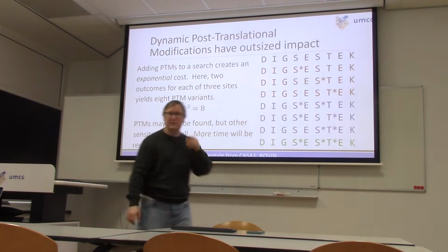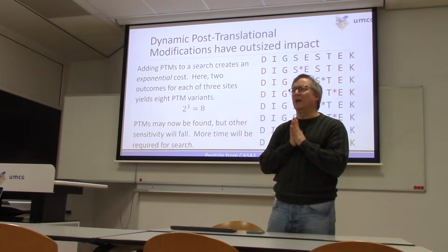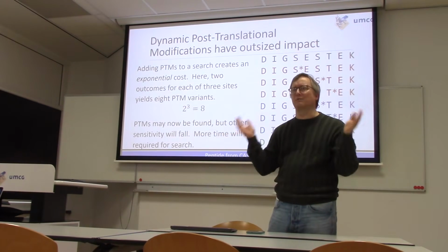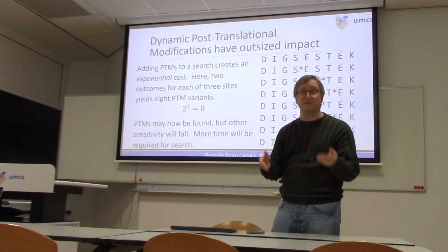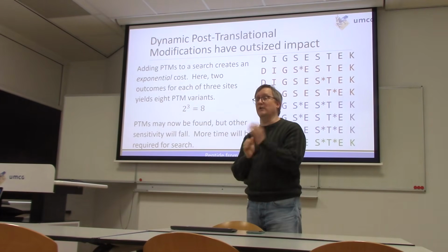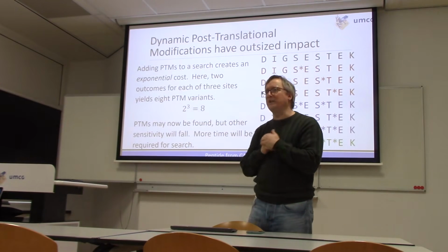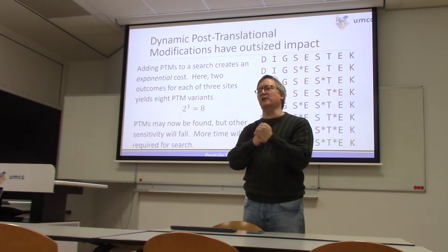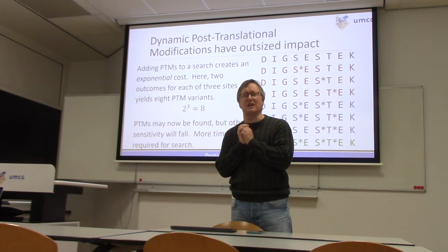So let's talk about decorating sequences with PTMs. Phosphorylation is one of the most popular post-translational modifications to identify by proteomics. It's a very common type of chemical modification for us to look at. What do we know about where phosphorylation typically occurs in proteins, in humans, let's say?